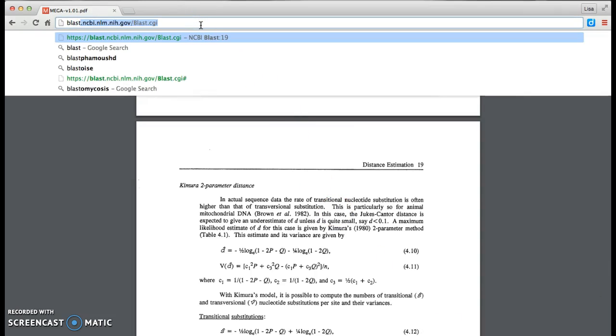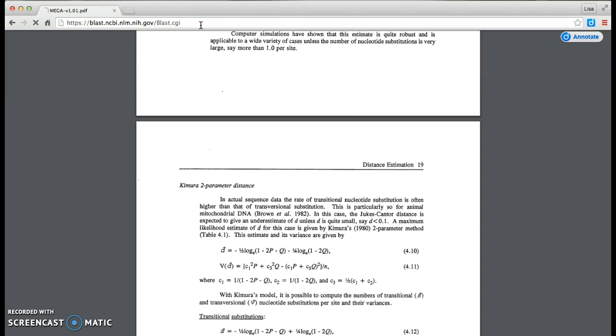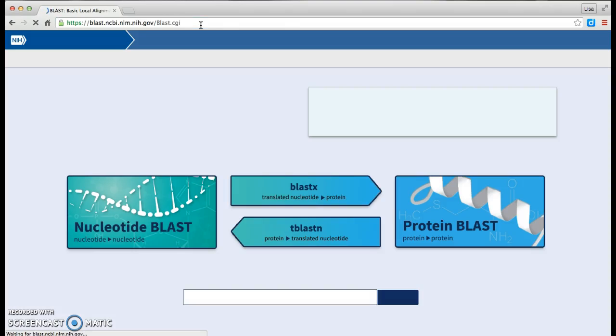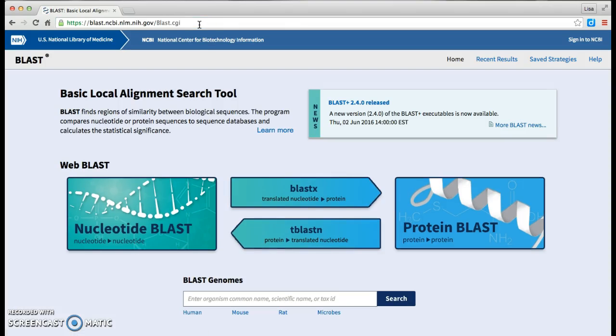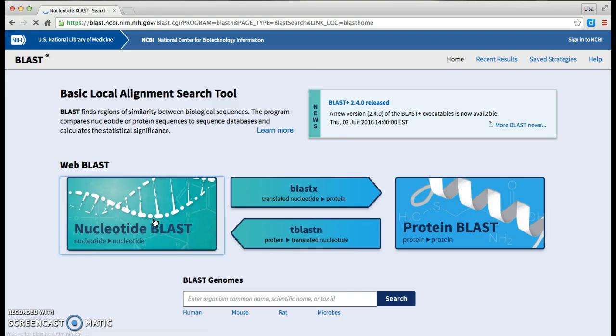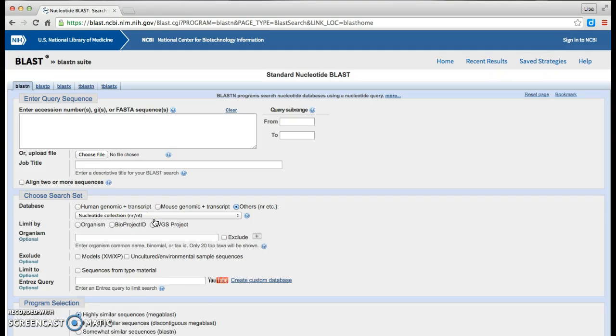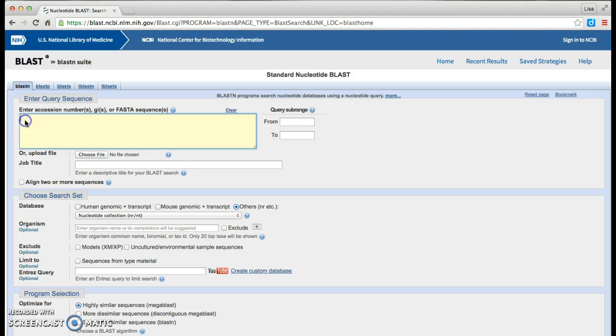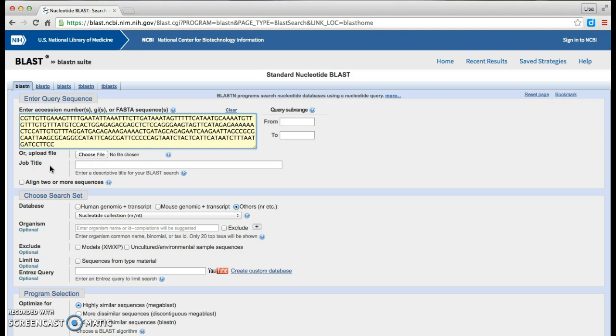I'm choosing Blast, which is part of the NCBI site. And we are doing a nucleotide blast. I select this. I put my cursor into Enter, Accession Numbers, GIs, or FASTA Sequences. And remember we copied it, so now I have to paste it. And it's pasting just like you would in any type of word program.